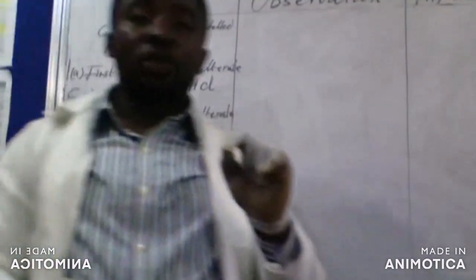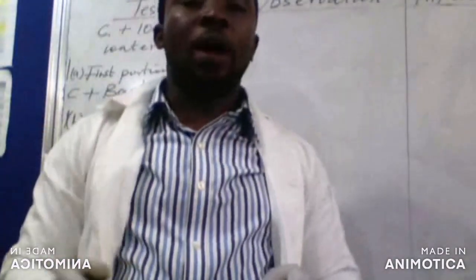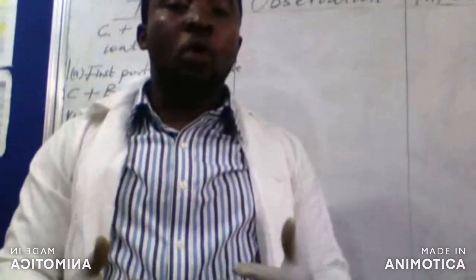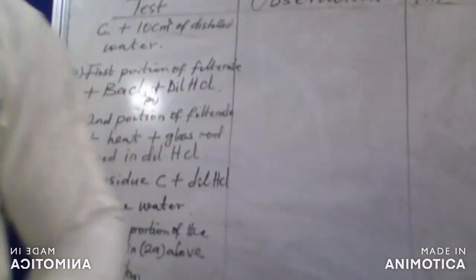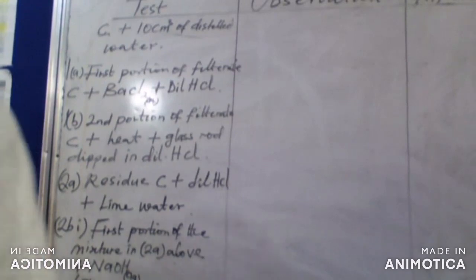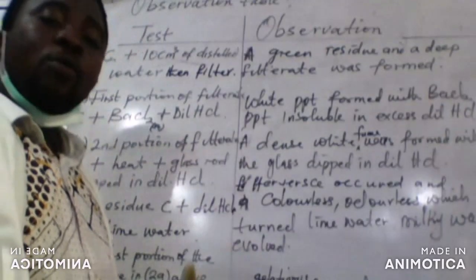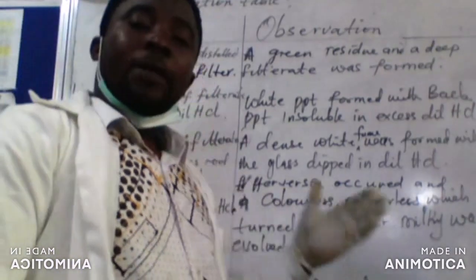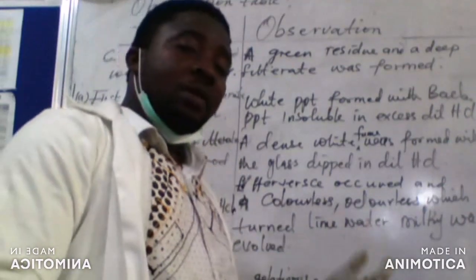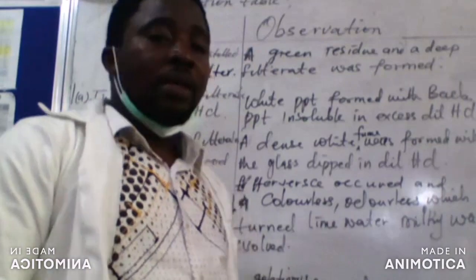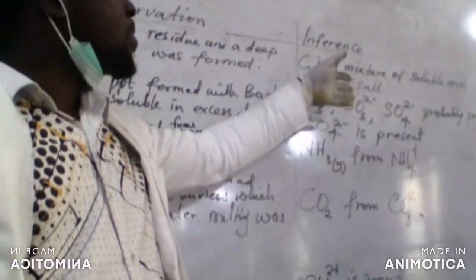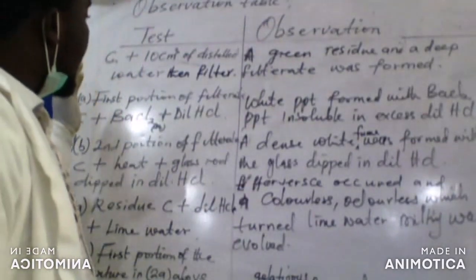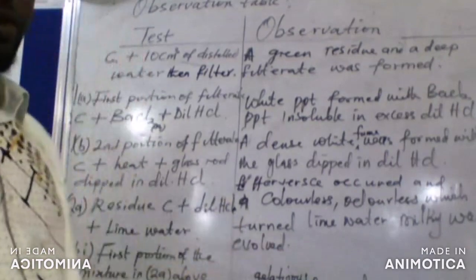Remember that the salt mixture must be in the ratio of 1:1, meaning the masses of the two samples need to be equal. I have my weighing balance. We were asked to add 10 cm³ to sample C and filter. We observed a green residue and a deep blue filtrate, and our conclusion is that C is a mixture of soluble and insoluble salts.